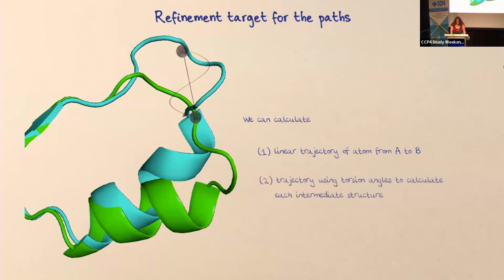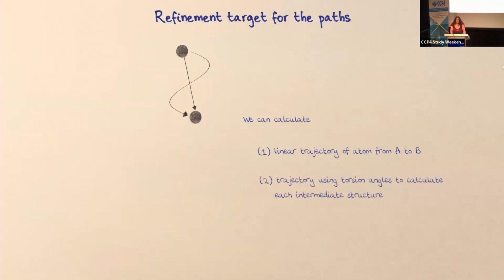If we have a look at those two paths for every atom, then the RMSD between the two paths acts as a way, if we minimize that, then we're minimizing the amount of momentum in the protein, because generally the momentum will be conserved as much as possible. So this reduces the amount of motion happening in the protein.